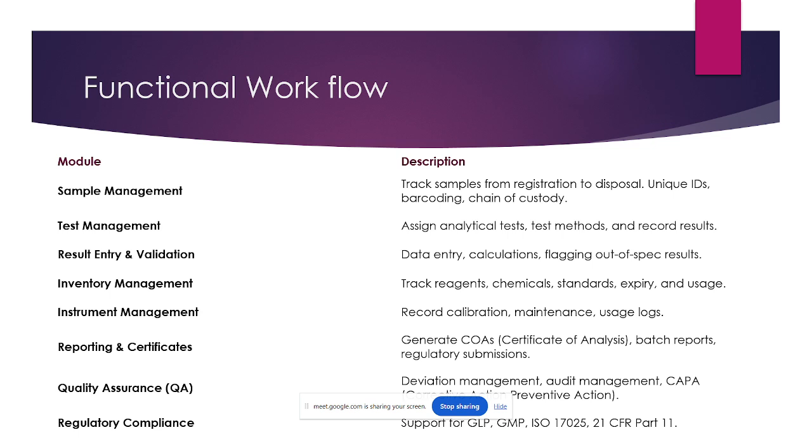Okay, and then these are the modules I told you. The sample management module will majorly be useful for tracking the samples. Registration and unique IDs will be generated, and from the barcode also a sample will be generated, and then we can check whether that sample is generated or not. So we can track the samples with the barcode or unique IDs.